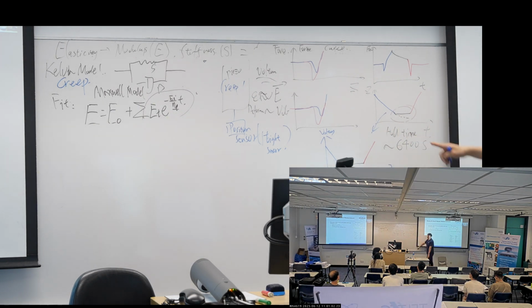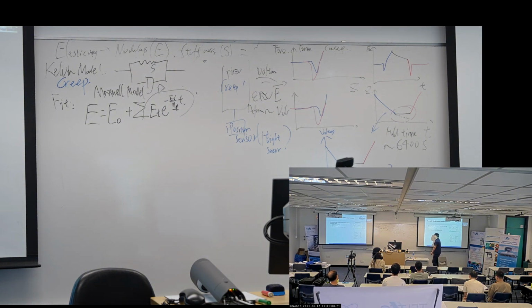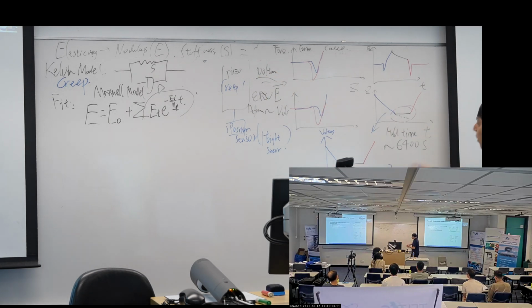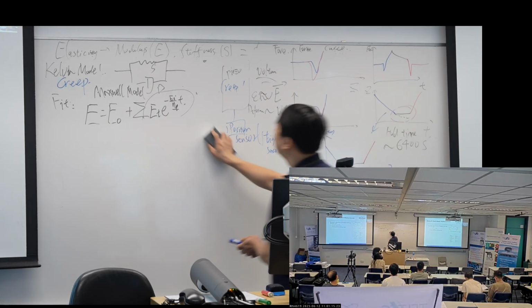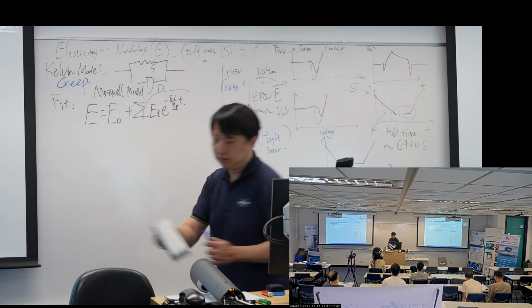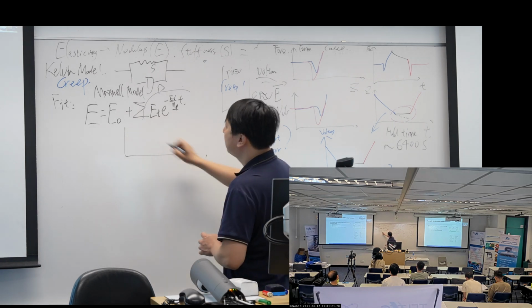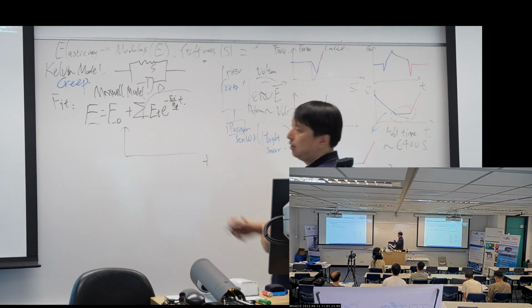So this sensor itself can read the real-time position of my piezo. For example, if my experiment is something like this, that's the time.